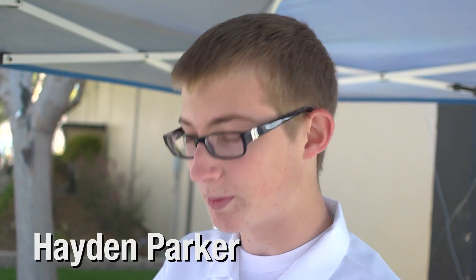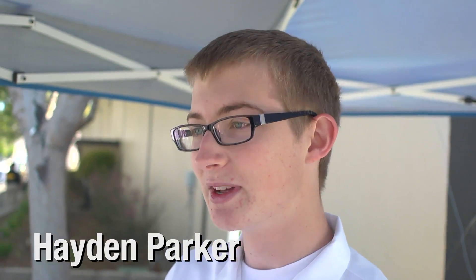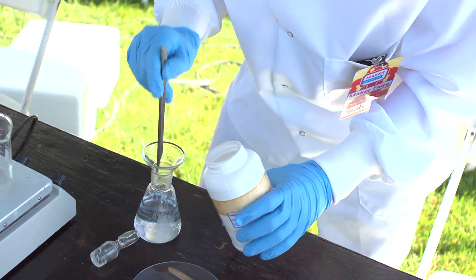I'm going to be doing a reaction where I have this bottle here and the solution will be clear, except when I shake it, it turns blue, stays blue for a few seconds, then turns back to clear. There's a whole lot of science going on there. So how this works is into this flask here I add sodium hydroxide.